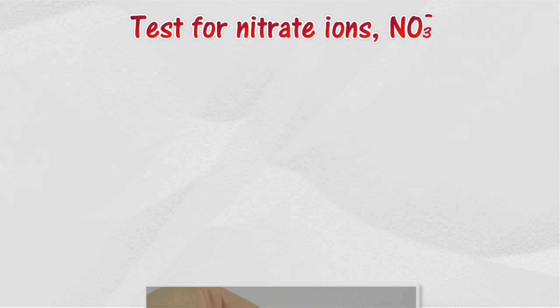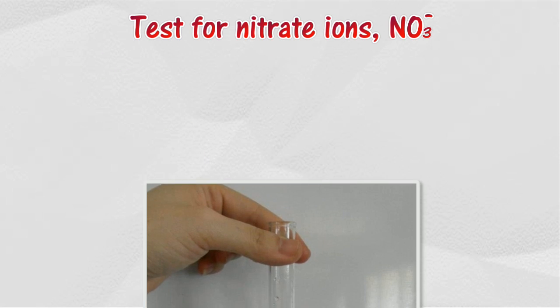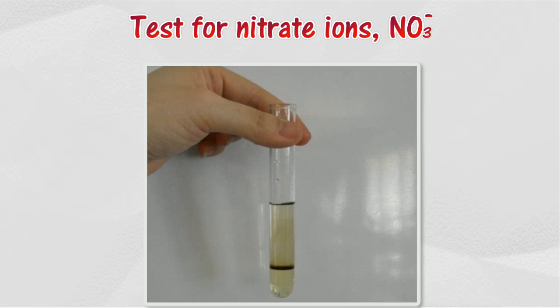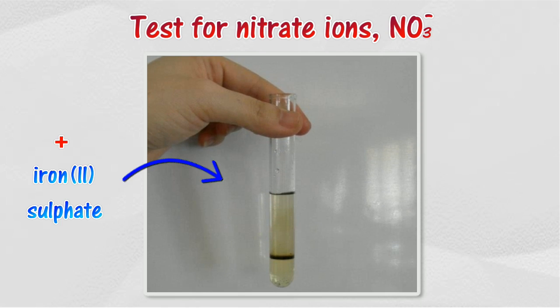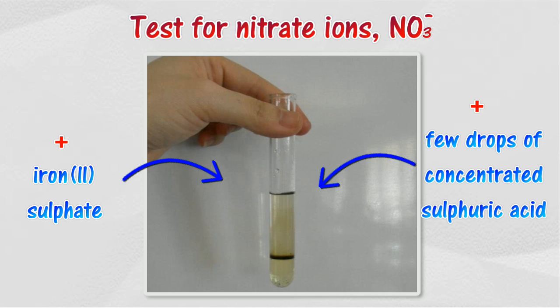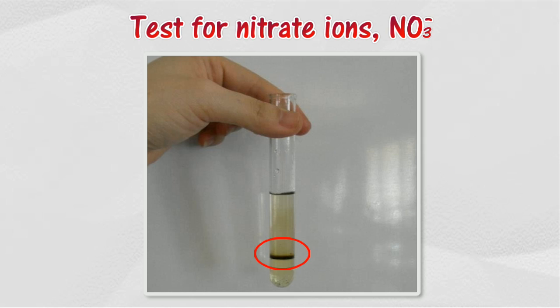Nitrate ion test: about two cubic centimeters of nitrate solution is mixed with dilute sulfuric acid and iron(II) sulfate solution in a test tube. Then a few drops of concentrated sulfuric acid are added slowly and carefully down the side of the test tube. A brown ring forms between the layers of concentrated acid and the nitrate mixture. The brown ring, composed of a complex ion, confirms the presence of nitrate ions.